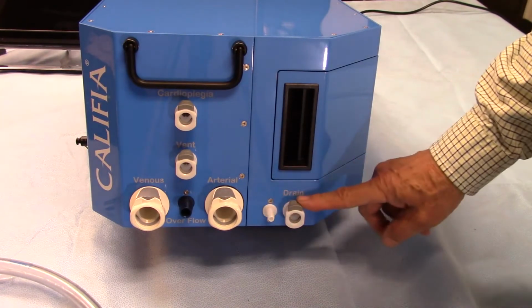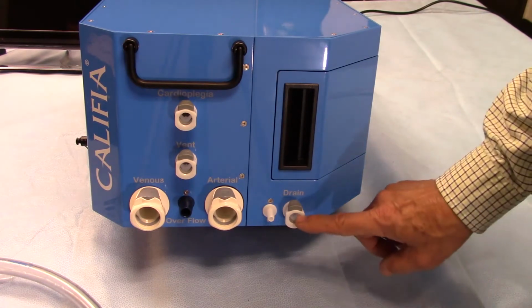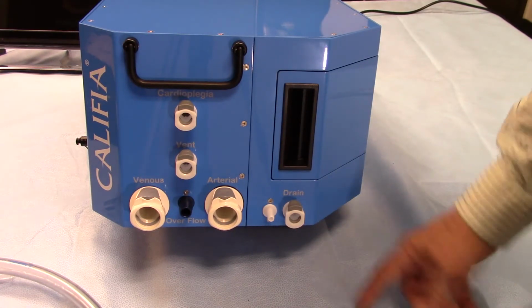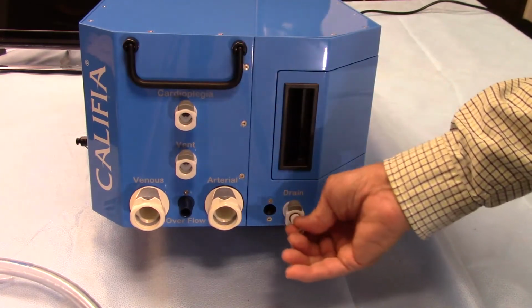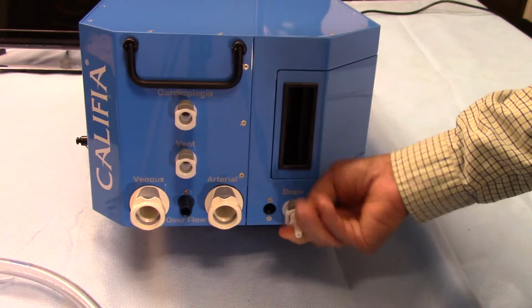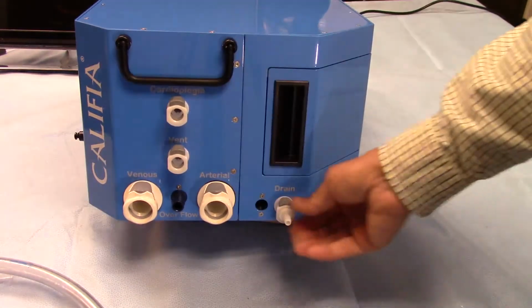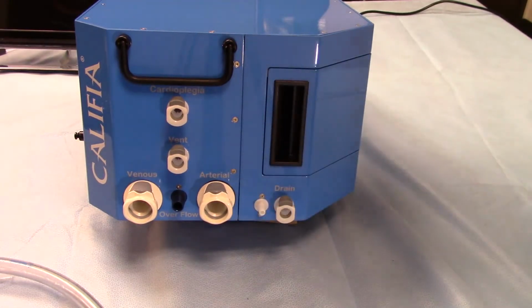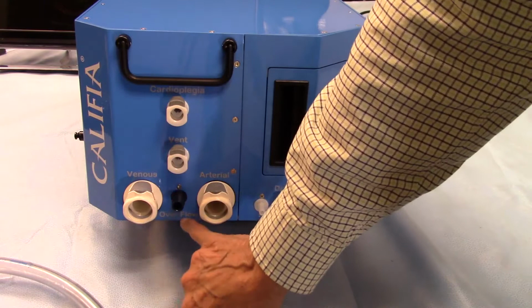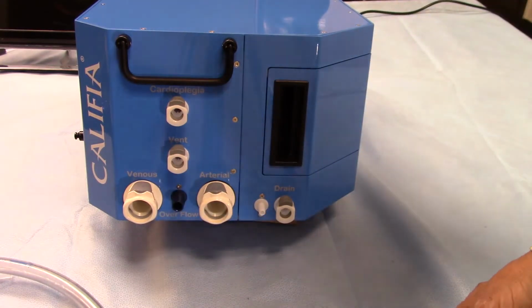On this side we have a little bit of a different situation. This is the drain connection. This connection does have a valve in it and won't be leaking at all until we put in the connector. The connector opens that, allows it to drain. It's basically just set right here for storage. Drain for overflow. Many times we'll put a 1/2-inch connector on that. We're not going to do that today.